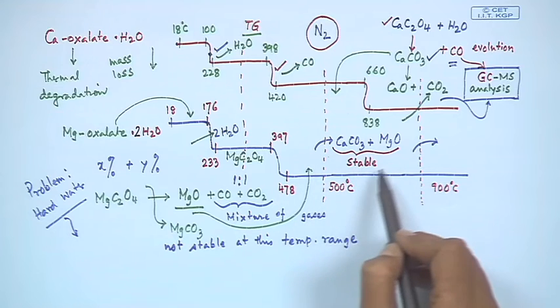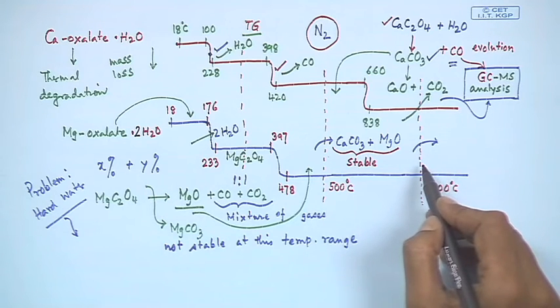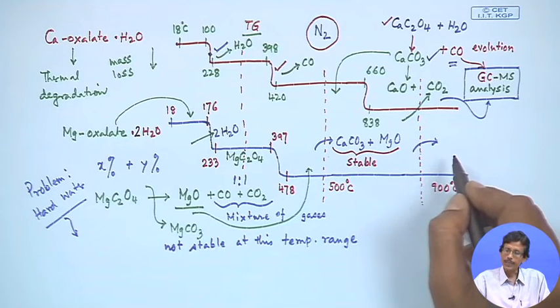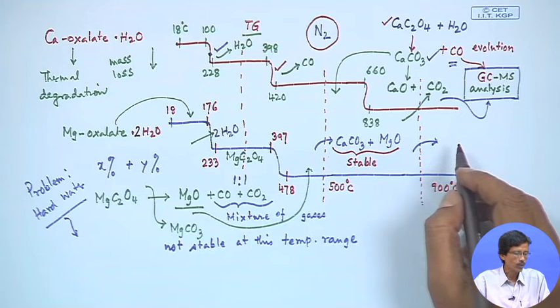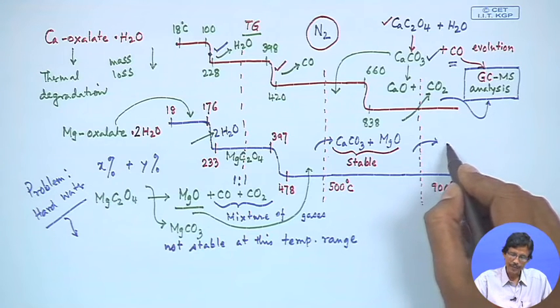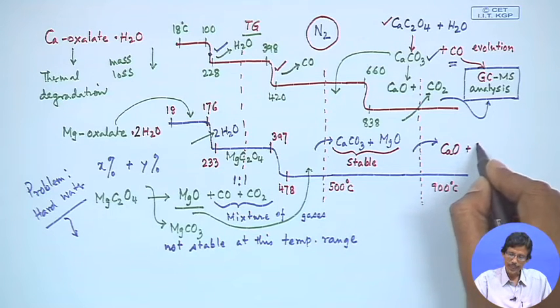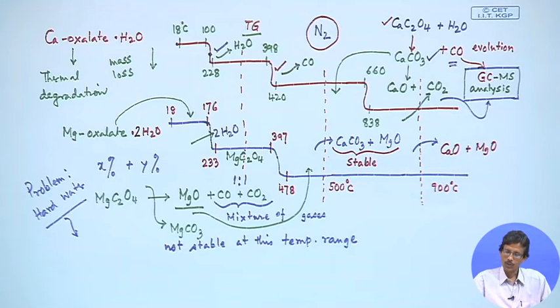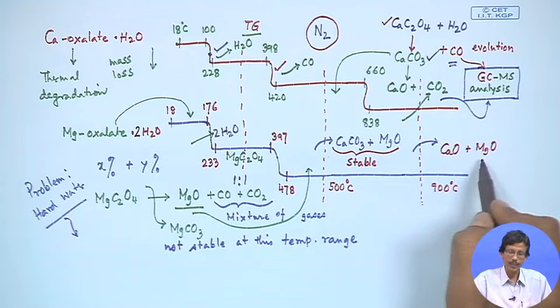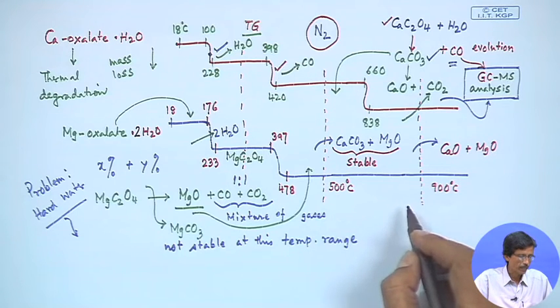And to check the particular percentage of magnesium and calcium present in the hard water, we take another help: heating the sample at 900 degrees centigrade. Heating the sample at 900 degrees centigrade also gives another piece of information, because both of them can exist as simple oxides, that means calcium will be present as calcium oxide and magnesium will be present as magnesium oxide. So, this gives immediate information, from the analysis of the amount of calcium oxide and magnesium oxide and the comparison of the weights of the mixed precipitate.